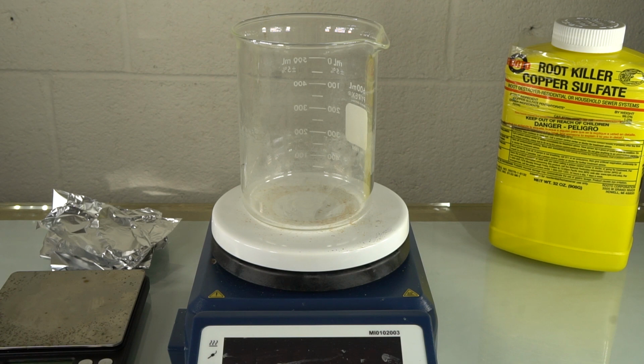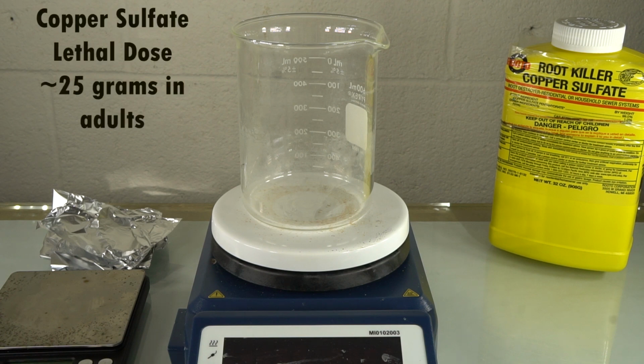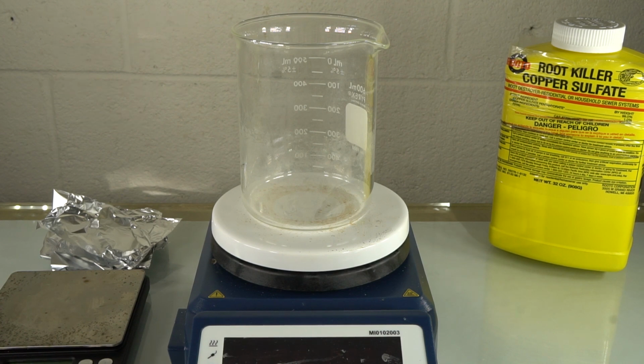I will say that copper sulfate is somewhat toxic, so this experiment should be done with adult supervision. Really, you just need to make sure that nobody eats or drinks the copper sulfate, and you don't want to scoop it up by hand or get it on your hands.